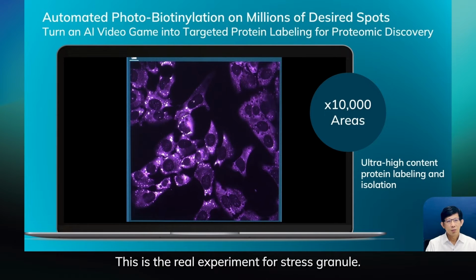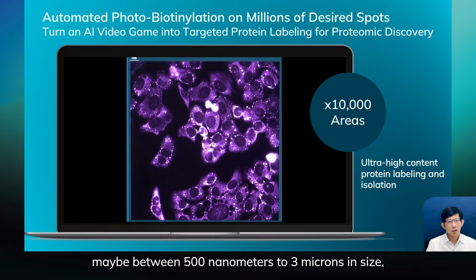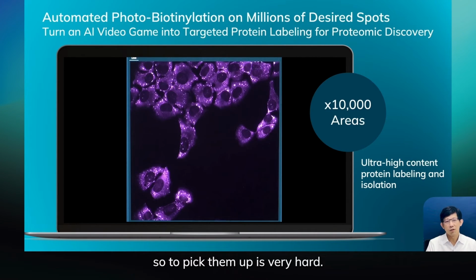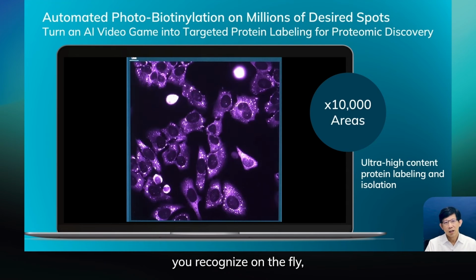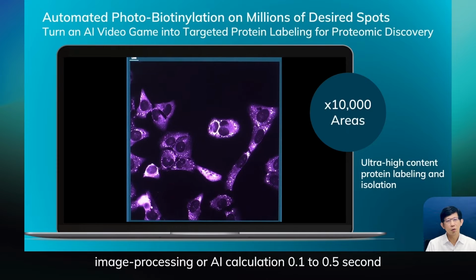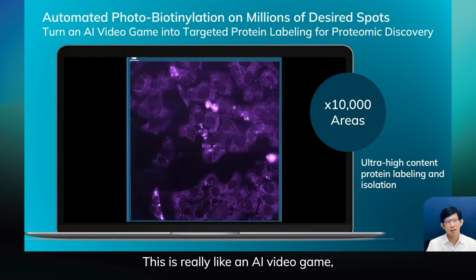This is a real experiment for stress granules. Stress granules, you can see, are very small inside the cell, maybe between 500 nanometers to 3 micron in size. So to pick them up is very hard. Now you can see this is automatic photobiotinylation. You recognize on the fly. So imaging takes 0.1 second, image processing or AI calculation 0.1 to 0.5 second, and you shoot live at this location. So this is really like an AI video game.